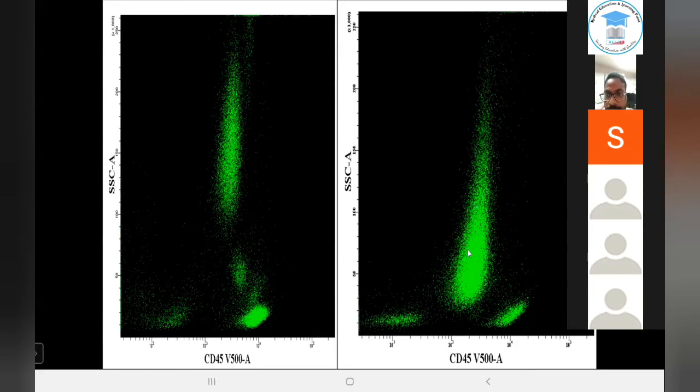Downward, very good. It's very interesting, the word centroid that you have said, that it seems like a teardrop, which is sort of pulling it down. The center of this entire population looks much lower compared to this one where you see a very high side scatter. So again, I would at this point not call it abnormal.